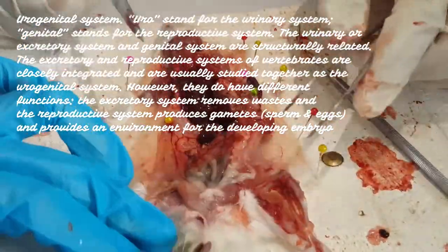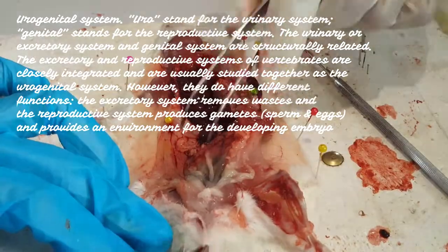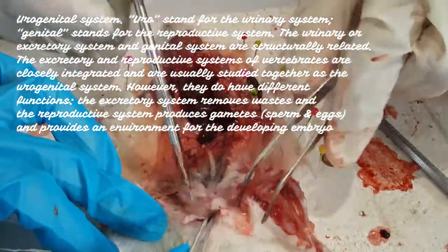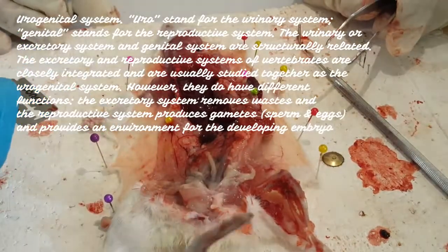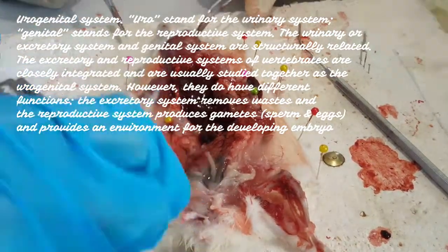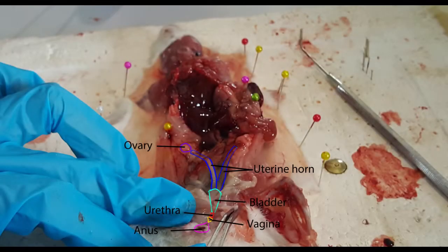The excretory system removes waste, and the reproductive system produces gametes, the sperm and egg cells, and provides an environment for the developing embryo. The short gray tube lying dorsal to the urinary bladder is the vagina. The vagina divides into two uterine horns that extend toward the kidneys. This duplex uterus is common in some animals and will accommodate multiple embryos.